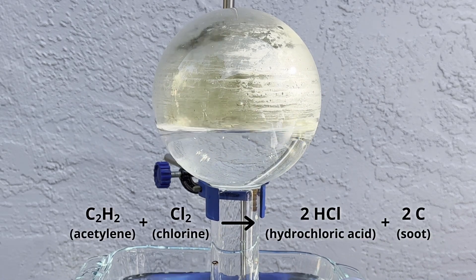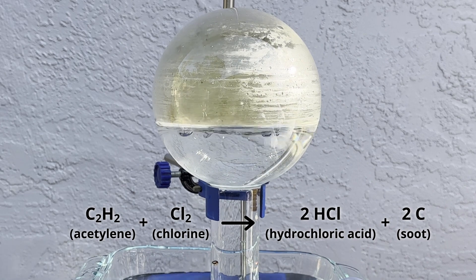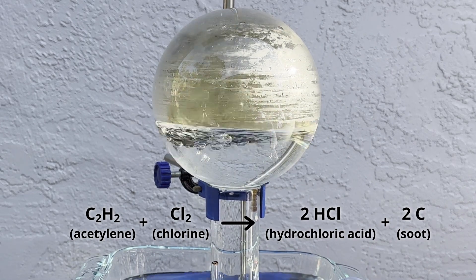Here, the acetylene and the chlorine react to make hydrochloric acid and carbon soot, which is the black stuff you can see floating around.